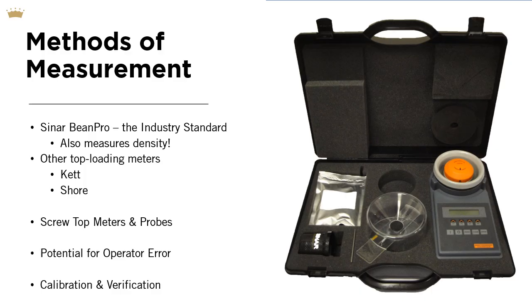The standards and the software in these types of devices tend to be based on a number of programs, and they're related to the most accurate and original method of measuring moisture, which would be to dry the coffee out in a very low temperature oven over a long period of time. Since most folks don't have the time to do that or the resources at hand, these provide a much more accessible and immediate way of measuring the moisture content of coffee.